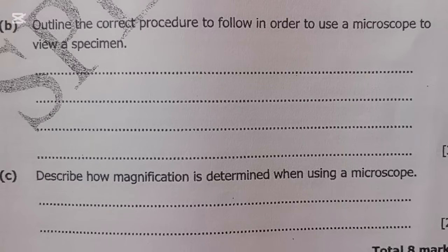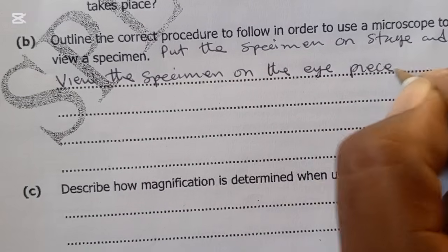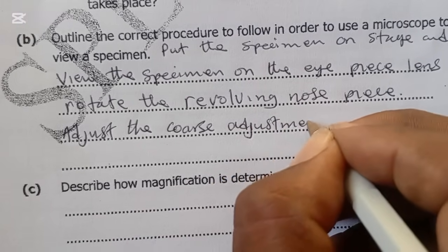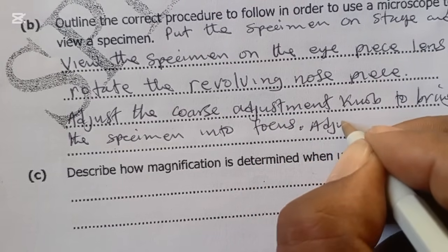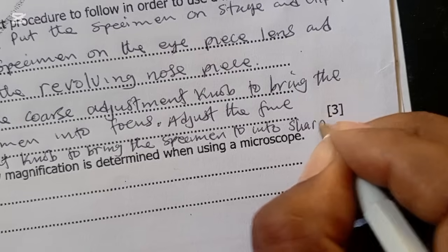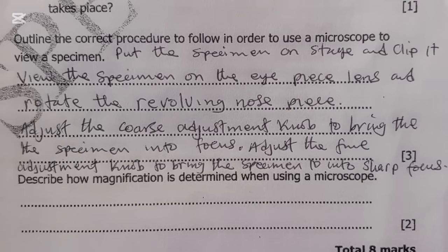And we use the fine adjustment knob to bring the specimen into sharp and clear focus.